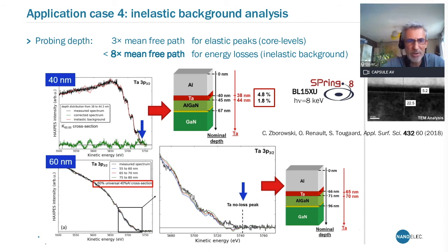However, you have a very strong signal of the energy loss electrons, which you can analyze through a particular methodology. And you can reconstruct basically the depth distribution of tantalum. This is what we have been doing in this experiment.